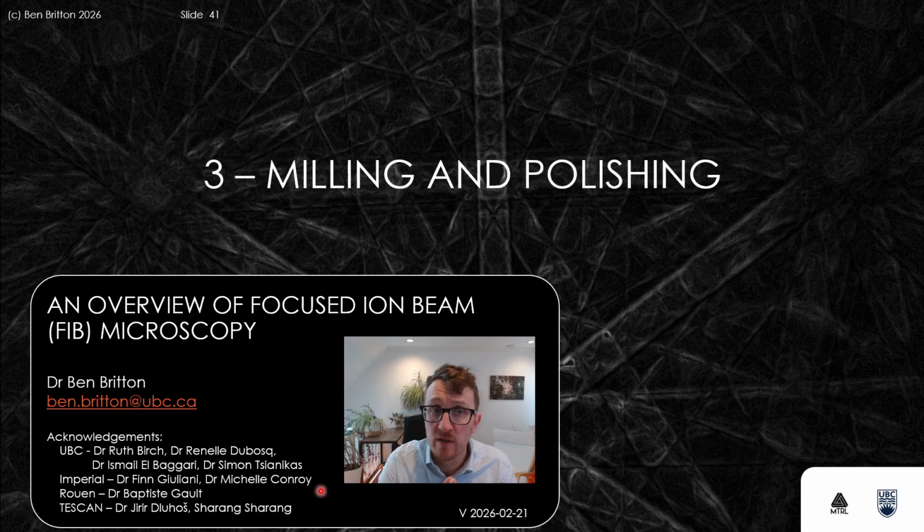Hopefully you've had a chance to view lectures 1 and 2. If not, I'd strongly recommend that, although of course this does stand on its own to help you understand milling and polishing for focused ion beam methods.